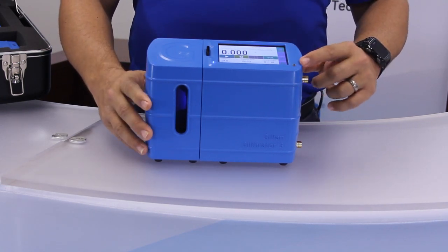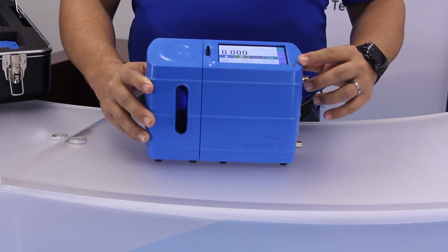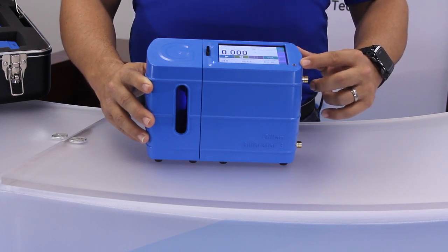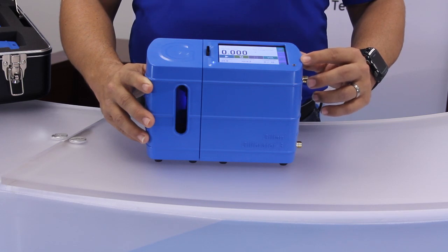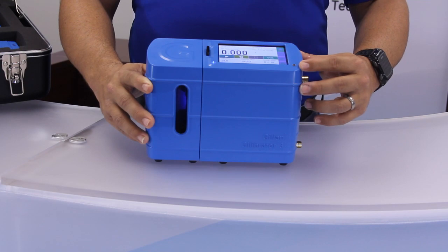The charge indicator LED will be turned off when no power supply is connected. When connected, it will turn red while charging, green if fully charged or trickle charging is occurring, and it will alternate red and green if the USB power is insufficient to charge the battery while running.